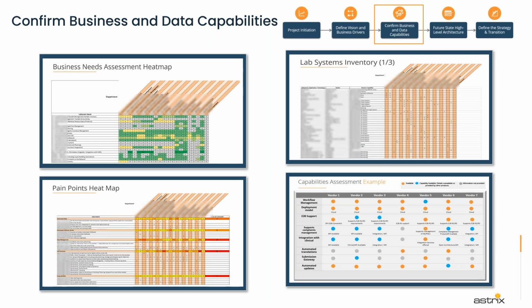Similarly, you may be using multiple systems in the lab that cause a lot of pain points. For example, as I mentioned before, to register a sample, how many clicks do you need to do? Other examples are uploading information from one specific site to another, transporting instrument data, or changing a status that takes more than 15 minutes.